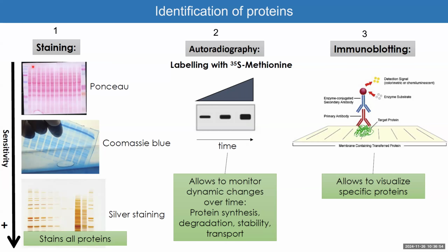So this is like 250 kilodalton, 220, 100, 75, something like that. And then as you go down, this is the lower molecular weight up to like 10 kilodaltons of proteins. So when you blotted your proteins from the gel to the membrane, you already know which one is higher molecular weight and lower molecular weight.